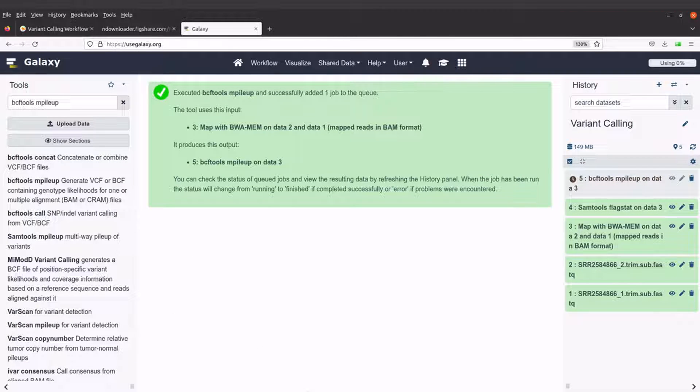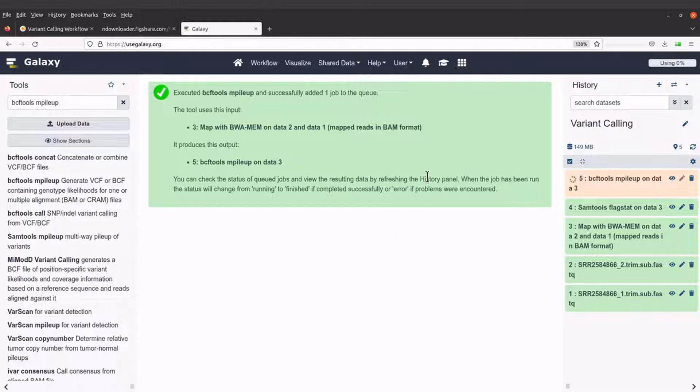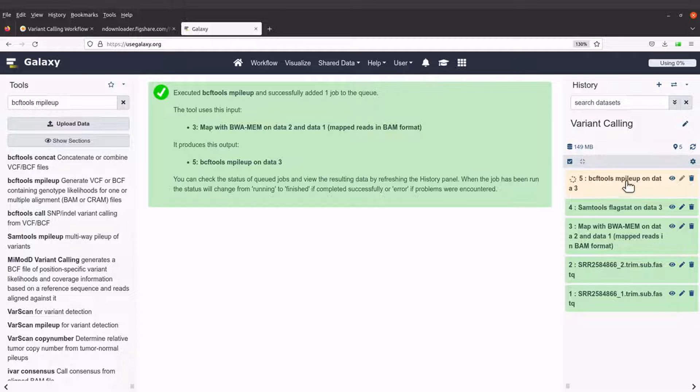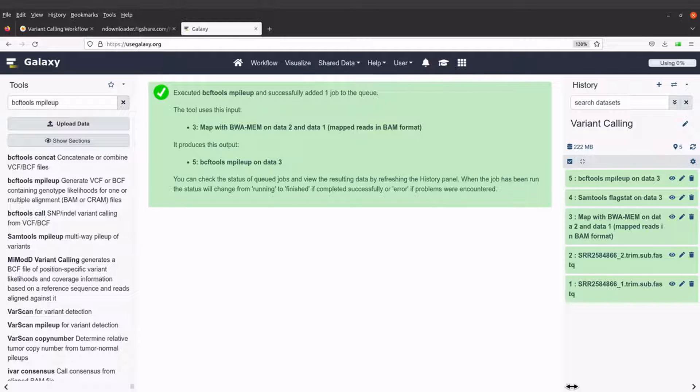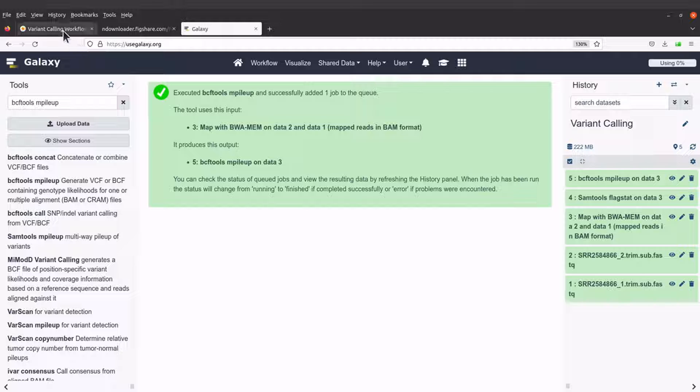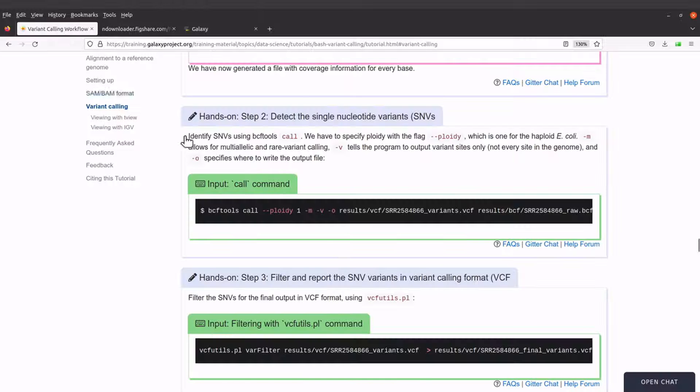Okay, so let's wait for bcftools mpileup to do its work. We can see that the job is running now. Okay, bcftools mpileup has completed its work. Let's move to the next activity.